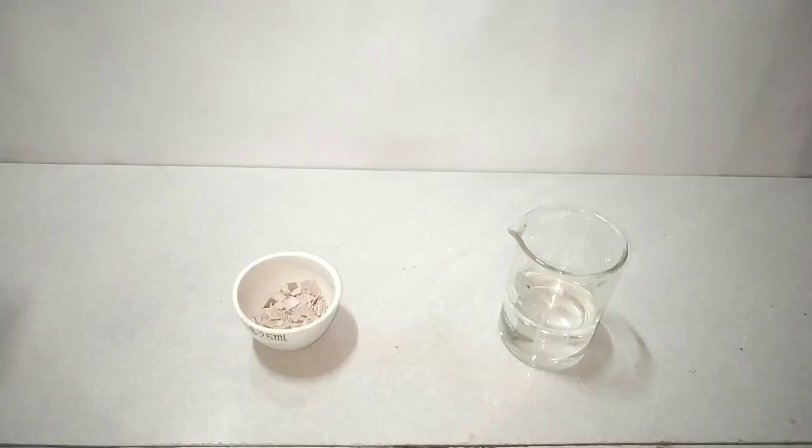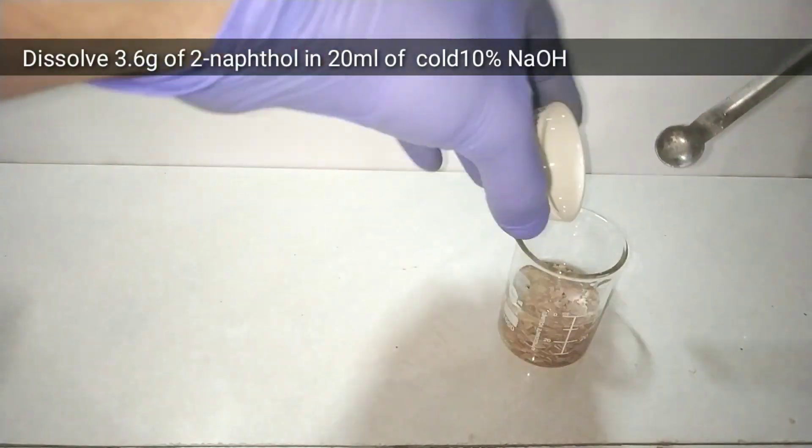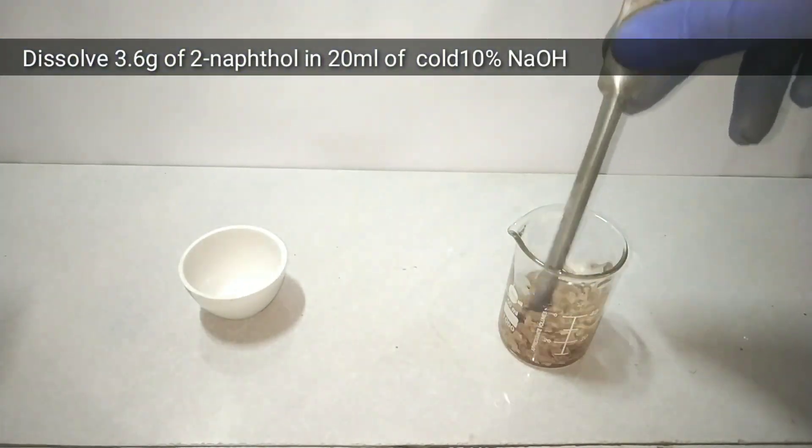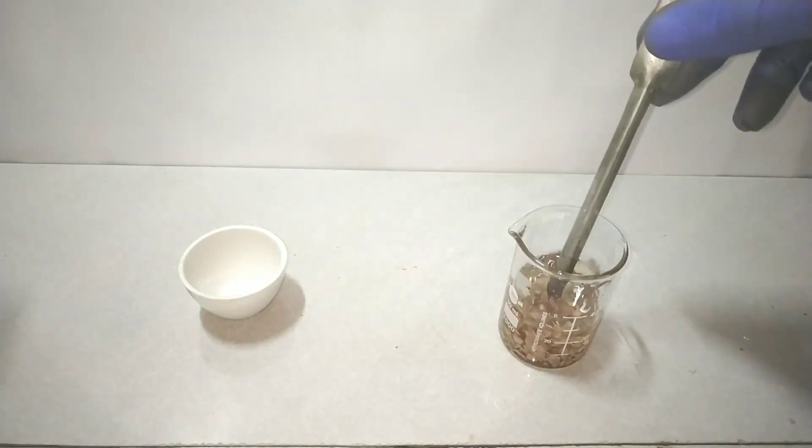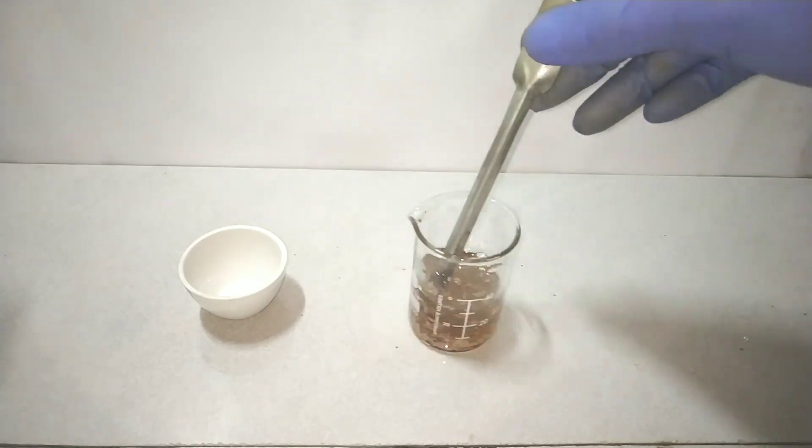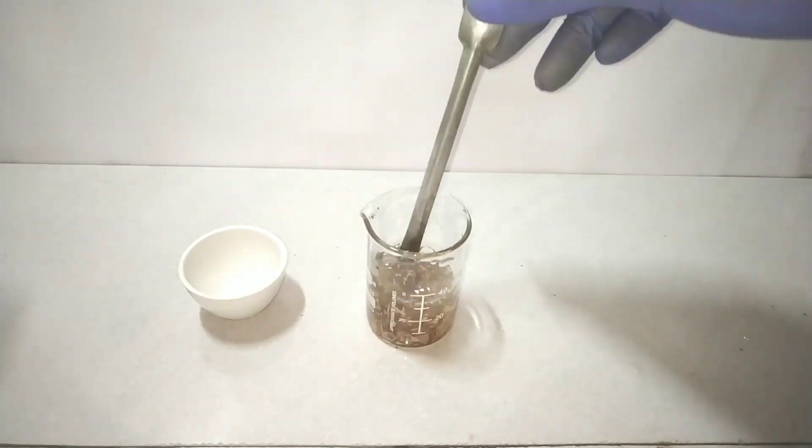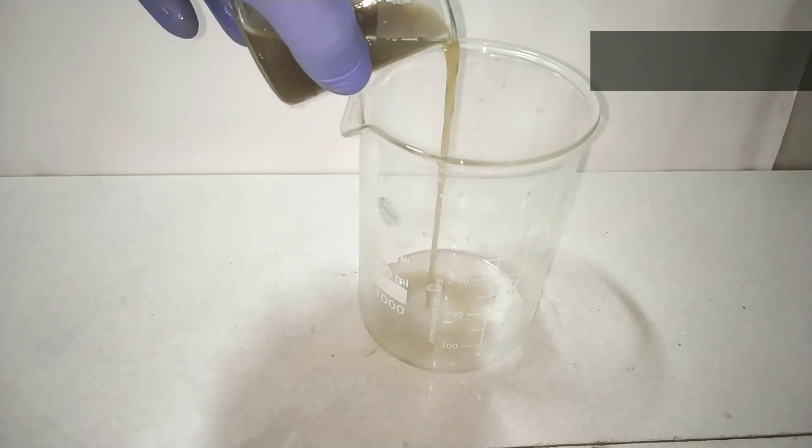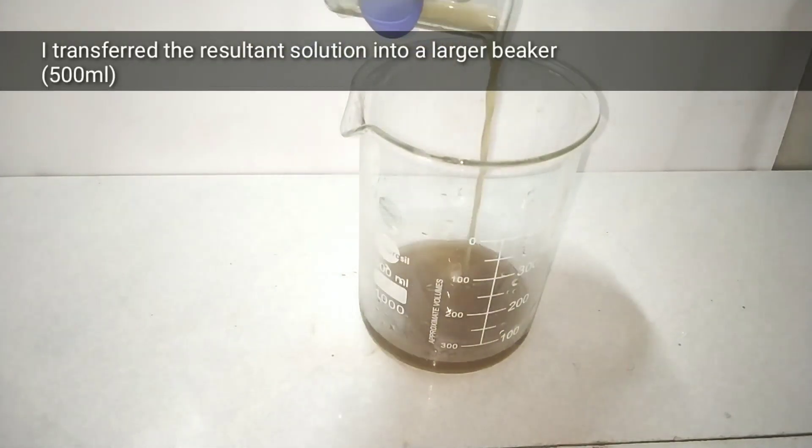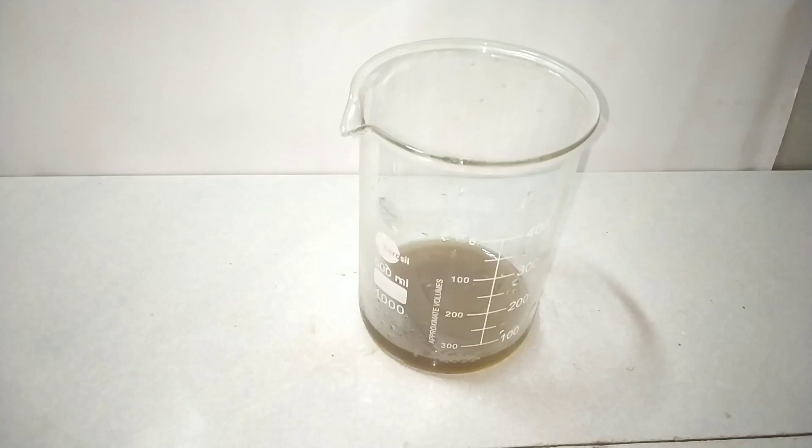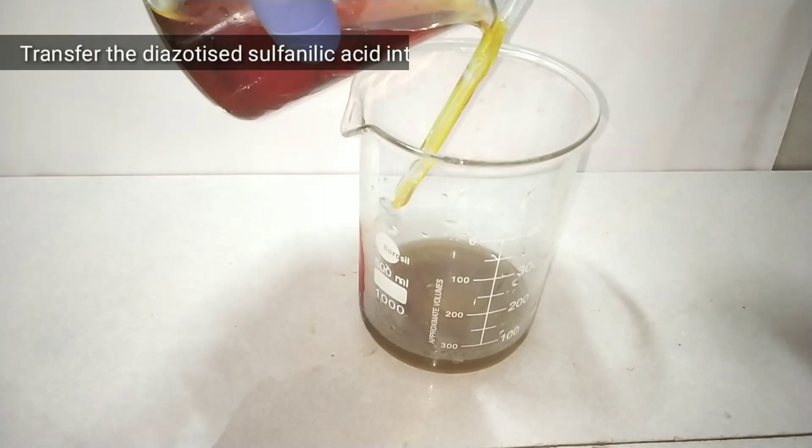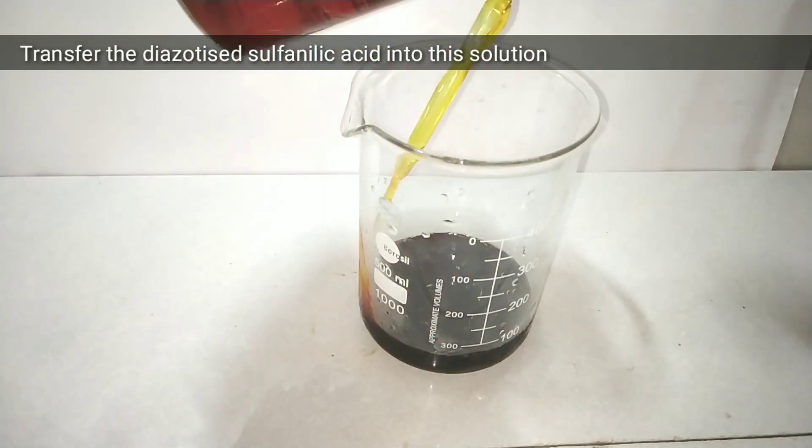So we have completed the diazotization and now we move on to coupling. For that we have already measured out 3.6 grams of 2-naphthol which we are mixing in 20 ml of 40% sodium hydroxide. 2-naphthol is slightly soluble in water but dissolves readily in alkaline solution because it is a weak acid. The sodium hydroxide also helps to neutralize the acidic byproducts of the reaction.